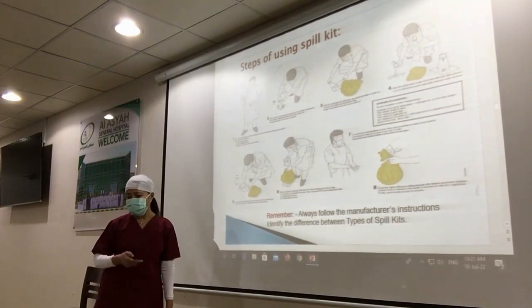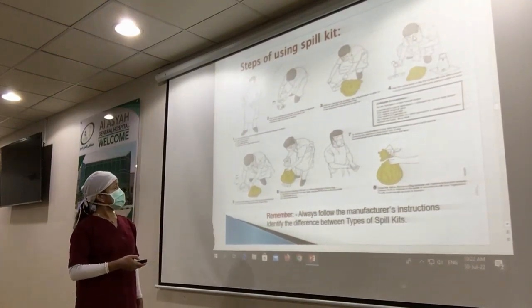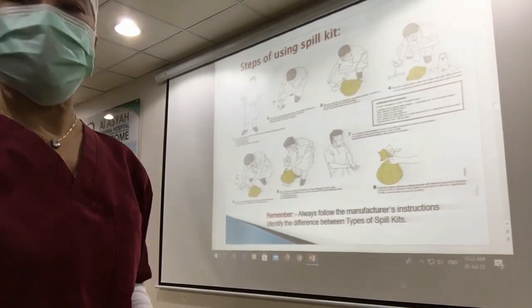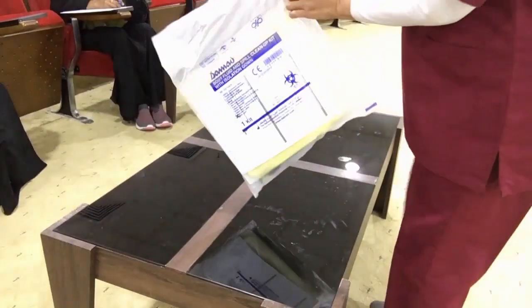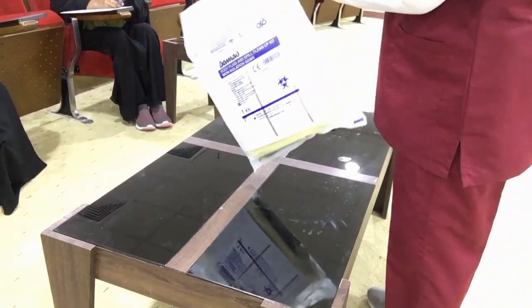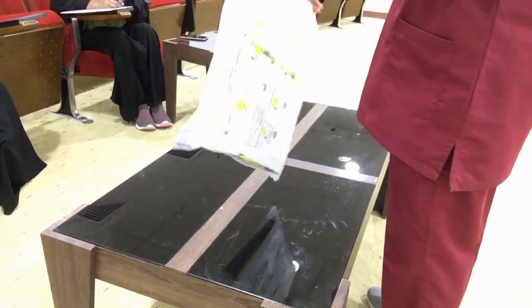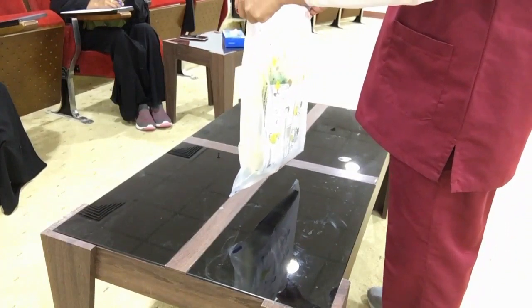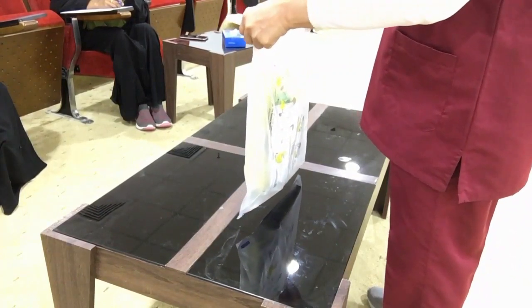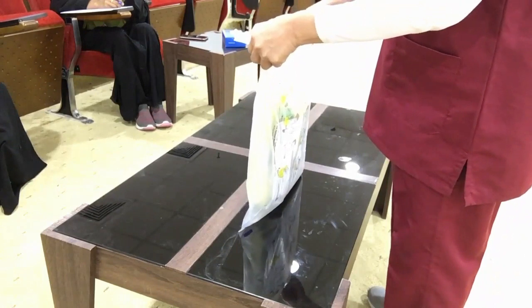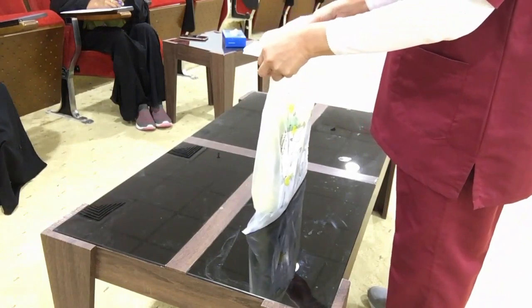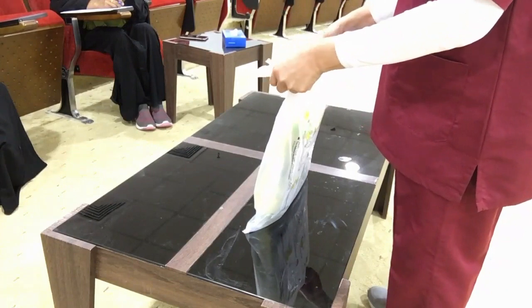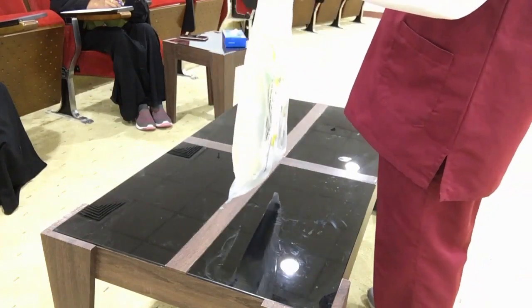Now I will demonstrate to you the steps of using the spill kit. This is the spill kit we are using in the hospital — it is considered disposable. In every department there are different spill kits: in the laboratory we have different ones, and also different in the OR. This one is for general use.